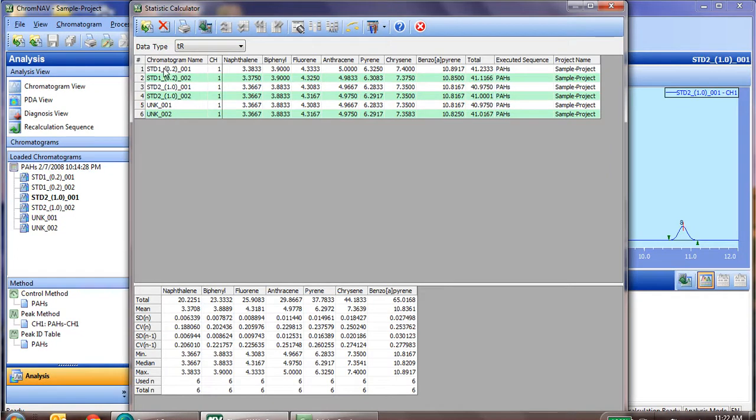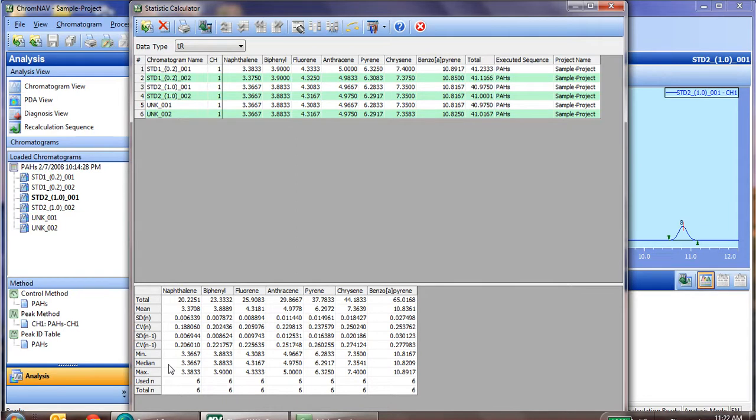So what we get is all of our chromatograms, and based on retention time that's been filled in for each, we get our standard deviations, our means, our totals if you add them up, and a relative standard deviation.